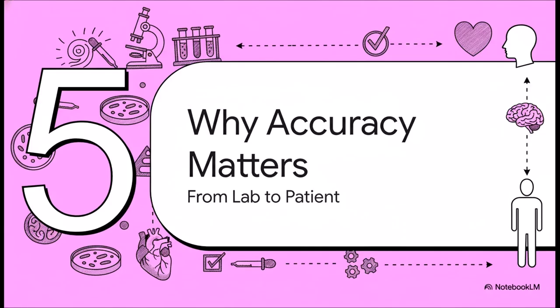So, we've gone through all the hows of messing up a gram stain. But now, let's talk about the why. Why are we so obsessed with getting this 100-year-old technique right? Well, it's because these results have a direct impact on real people, on patients.